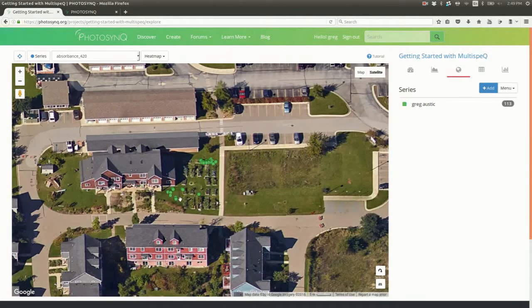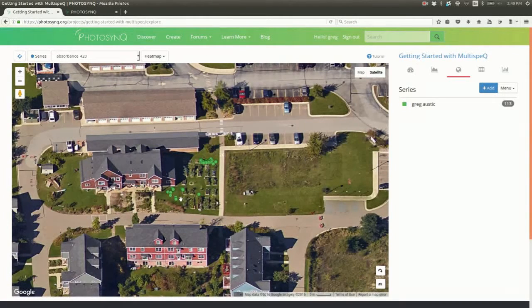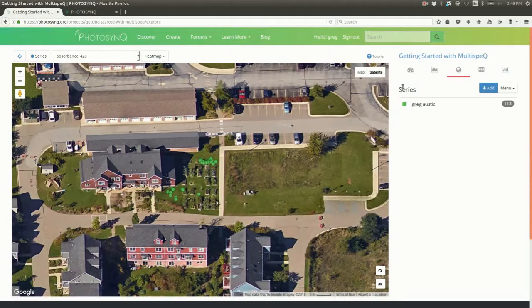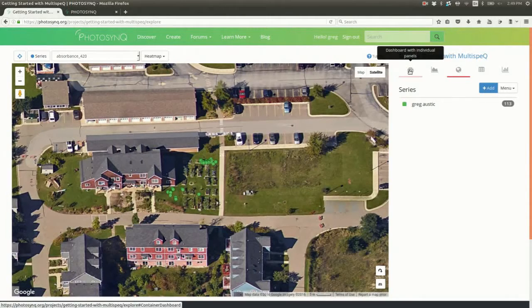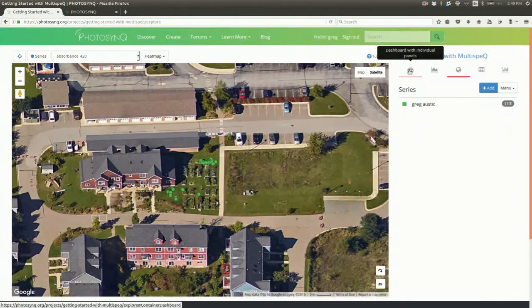Using the data explorer, you can actually confirm the data was collected at the right time, in the right order, at the right location, and so on. This is particularly important for a project creator to ensure data quality.